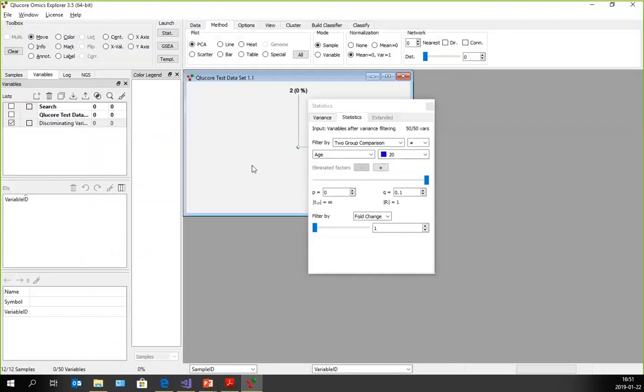So what we've seen today is templates executing. We've seen templates do things. We've talked about how to configure templates, a little bit on how to write them yourself, and how to do simple debugging with them at least. There are more advanced ways of doing debugging with templates, mentioned in the manual. You can actually run template commands interactively from a Python prompt as well. I won't be showing that today, but that's a good way of learning the commands that you can use. And a very good way of learning the commands is to just explore the example templates that we ship with the program.